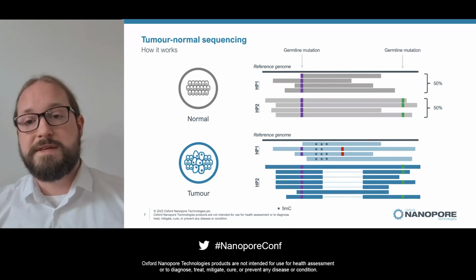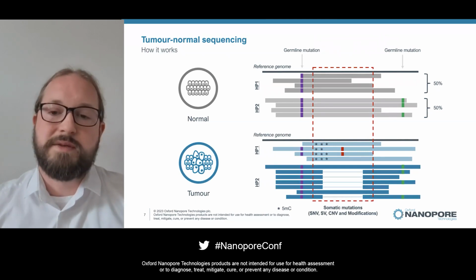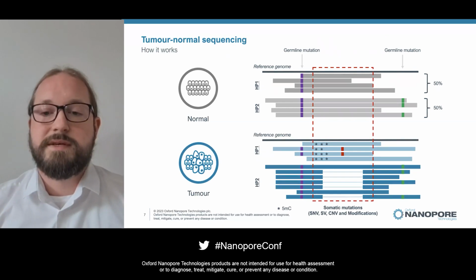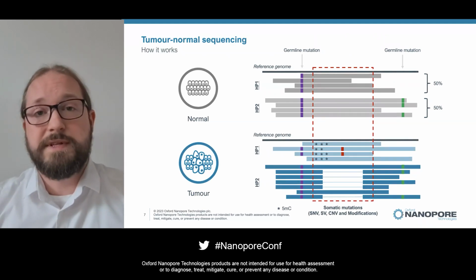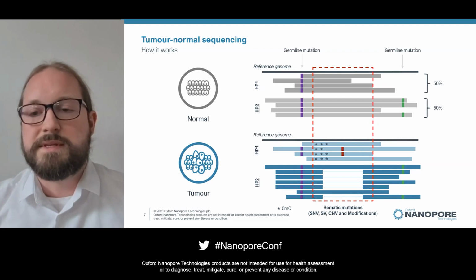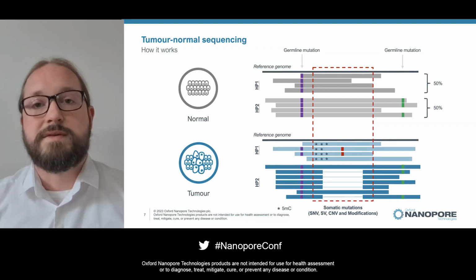But on top of these, we also can have a wide variety of other so-called somatic variants. Here I just show a depiction of a structural variation, a SNP, and modifications. Since it's cancer, they don't have to be in all of the reads in a haplotype, but they can be low allele frequency. So that's one of the things about somatic variation. Again, here we look at SNVs, indels, SVs, and modifications.